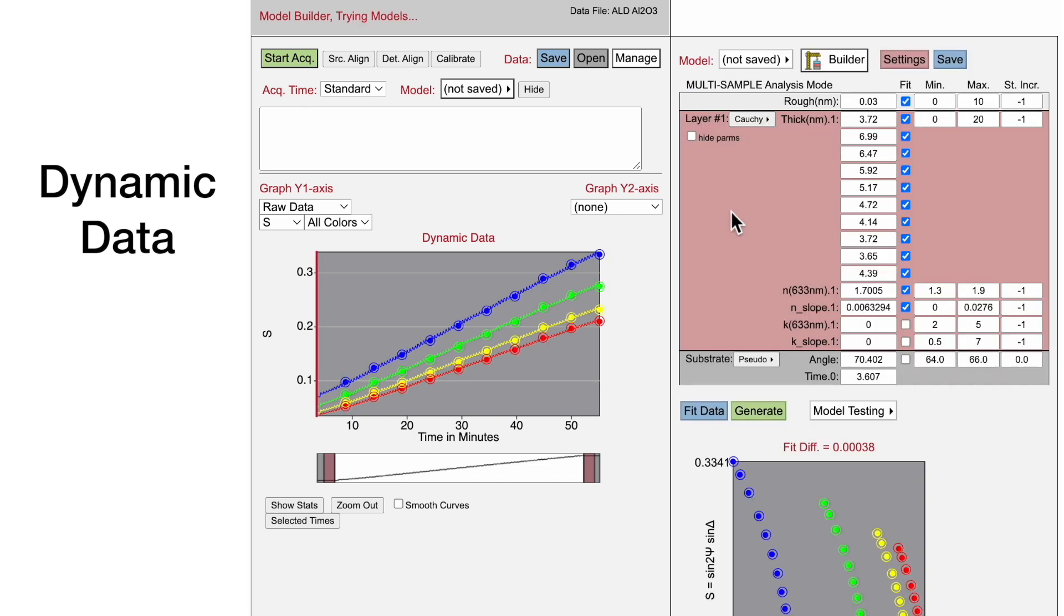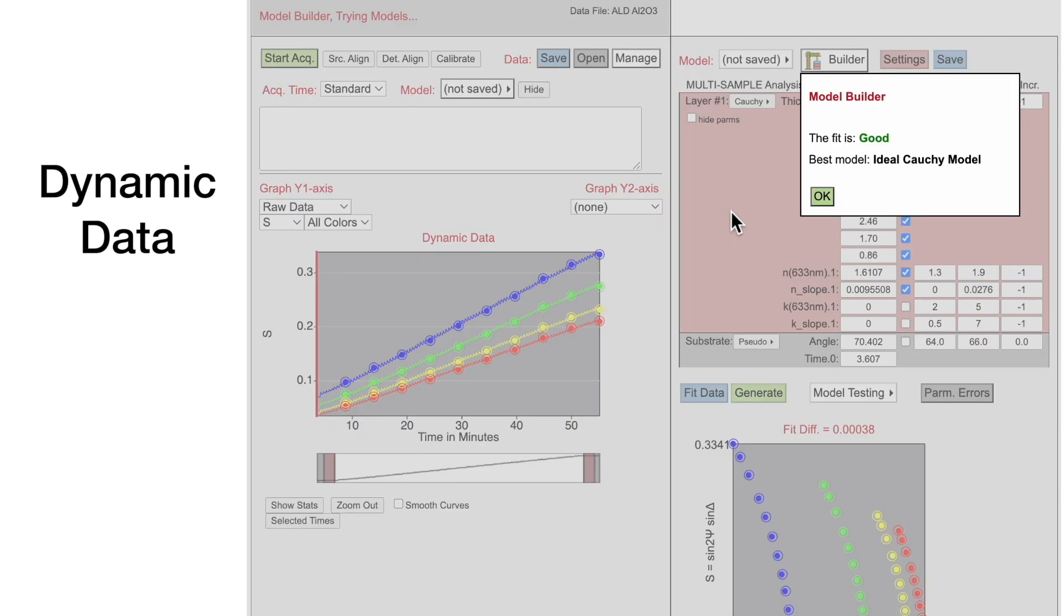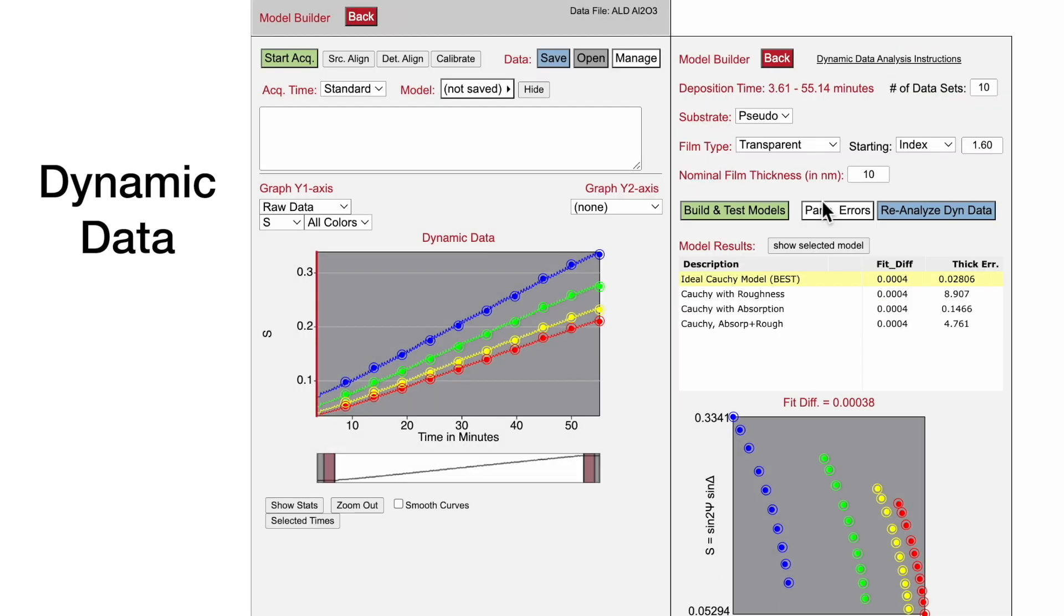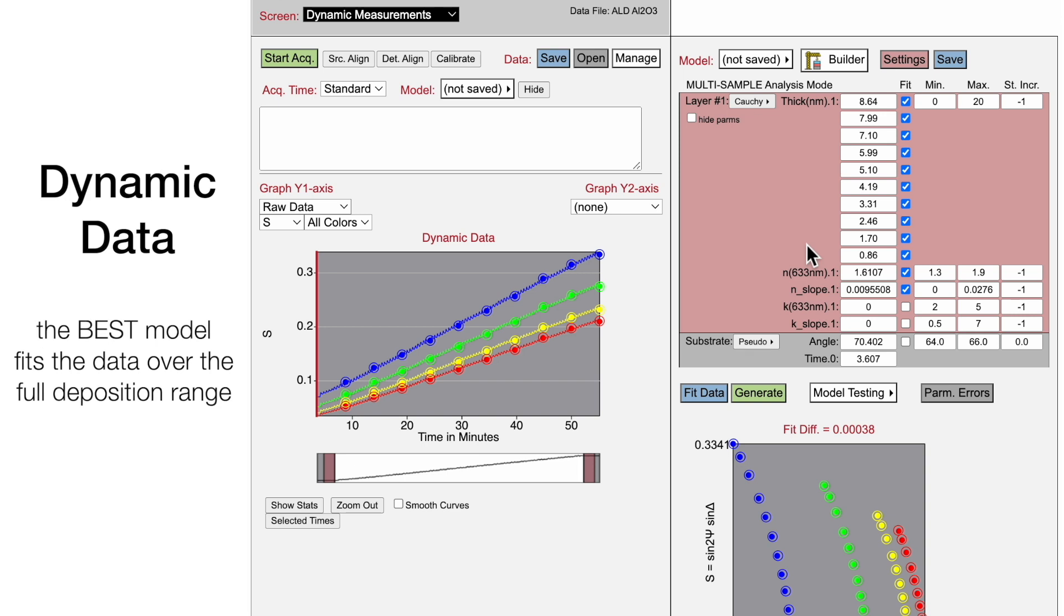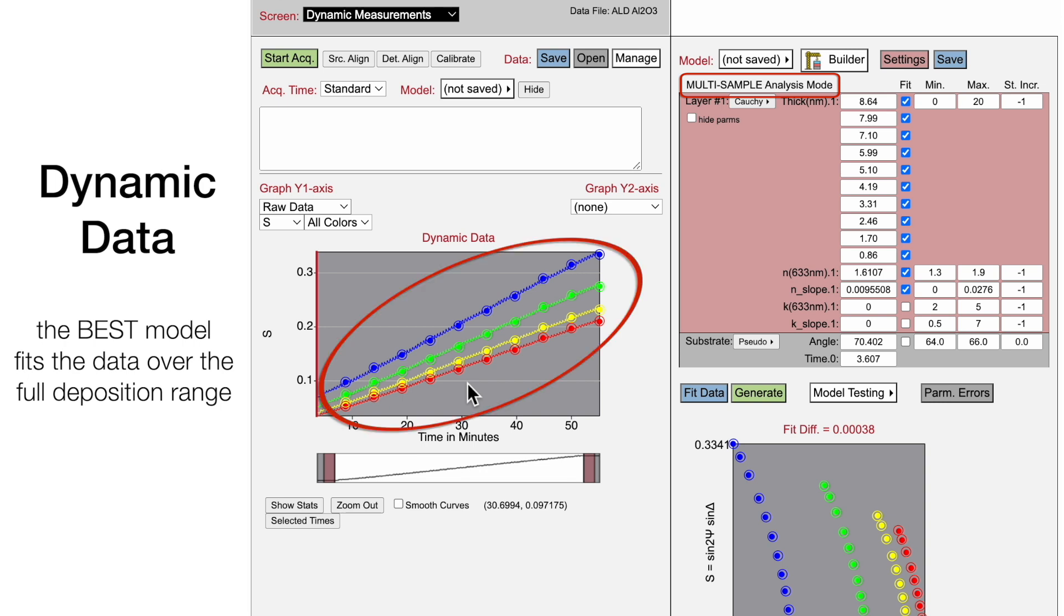The nominal film thickness after deposition is 10 nm for this sample. Then build and test models. Model Builder suggests that the fit is good using an ideal Cauchy model. To determine the best model for in-situ data acquired over the entire deposition run, Model Builder automatically sets up a multi-sample analysis, selecting 10 data sets evenly spaced across the deposition time.